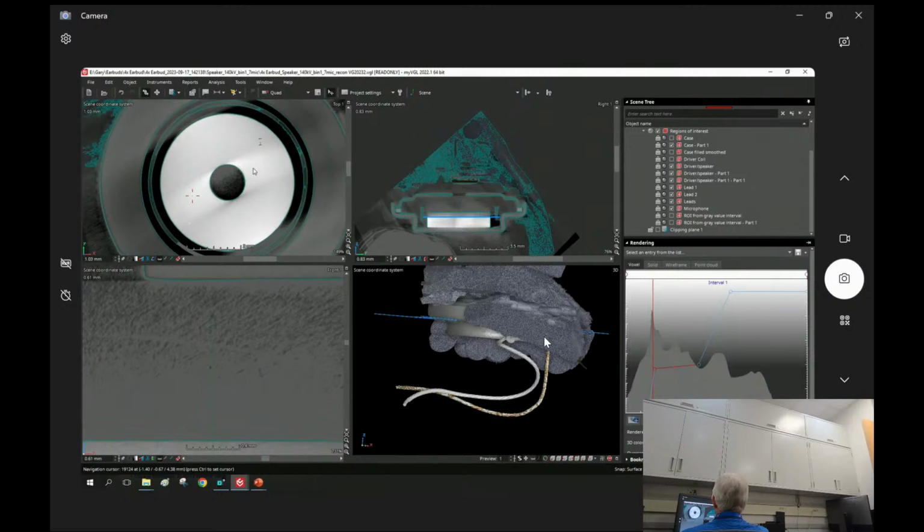Still, I can only see, again, depending on the psychologist that I reference, between, say, 8-bit gray or just over 100 grayscale values out to maybe 1,000. And a lot of people, the last time I checked, were in the 400 to 600 range. That's a lot less than the 65,000 grayscale values at 16-bit gray, and we could go to 32-bit gray. The human eye is only going to see that level of differentiation with color.